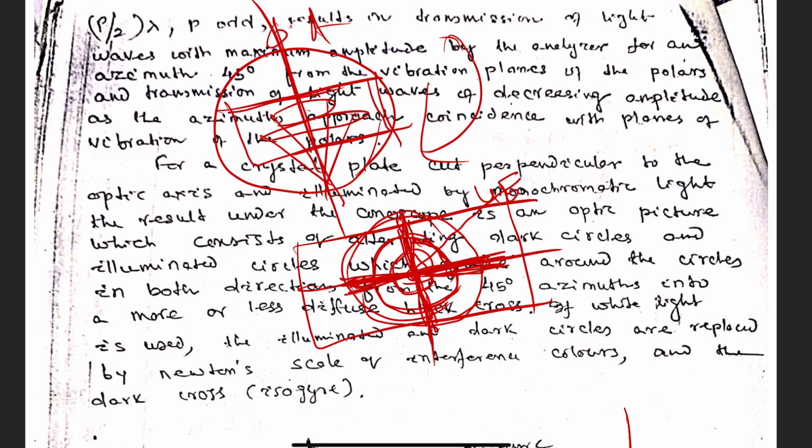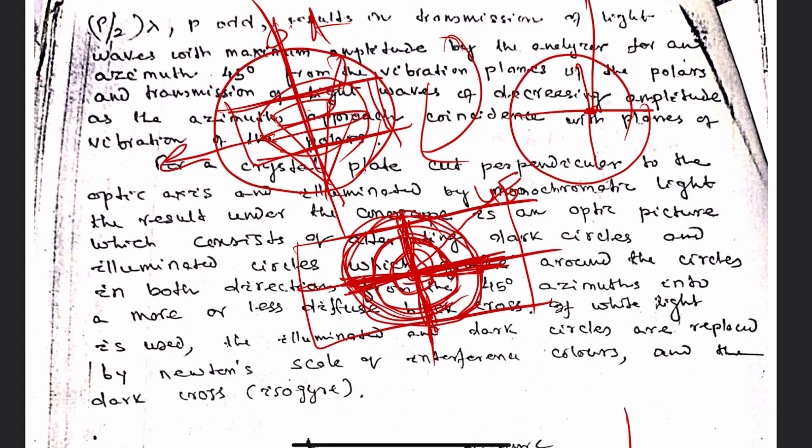If the mineral is of same thickness, it is shifted laterally, the effect will be same, no change in the shape of the figure, if the figure is being seen within the field of view. Thickness same, so when it is being rotated, the position of optic axis is not found to be changing.